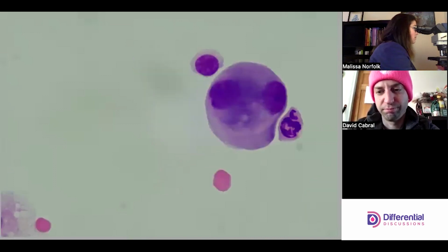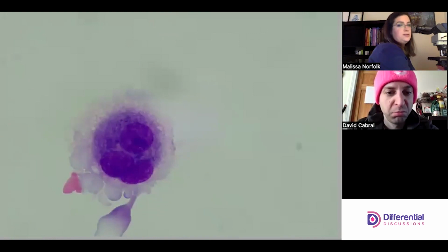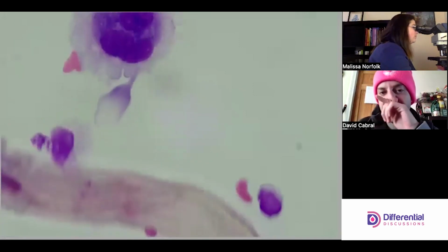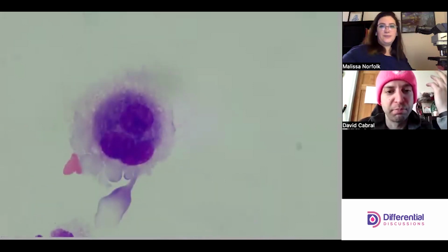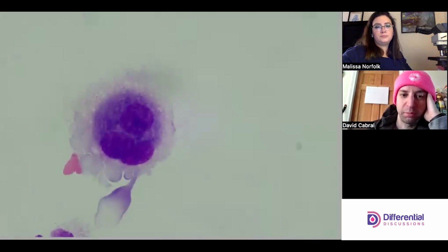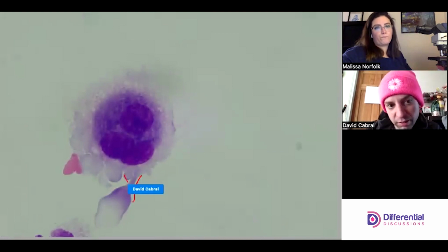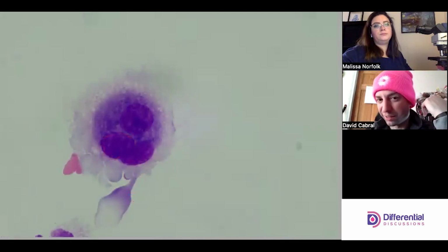I think there is another somewhere. Oh, there you are. I'll pull it a little bit more. So like three nuclei. I think it's probably more common to see two nuclei; three is a little less common. Some people might be troubled by some of the cytoplasm here. I'm less bothered by that, and I'm trying to really focus on what's going on inside. I think the nucleus looks somewhat reasonable. The cell's a little darker than I'd like.